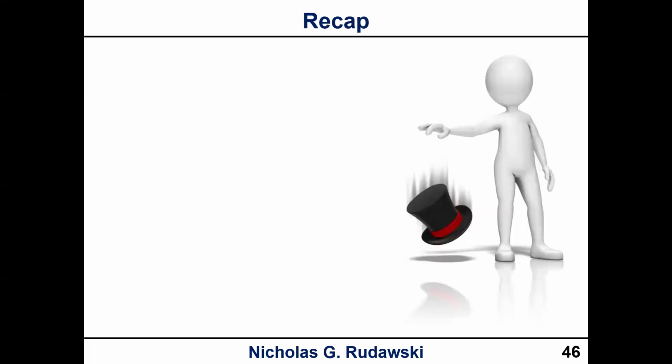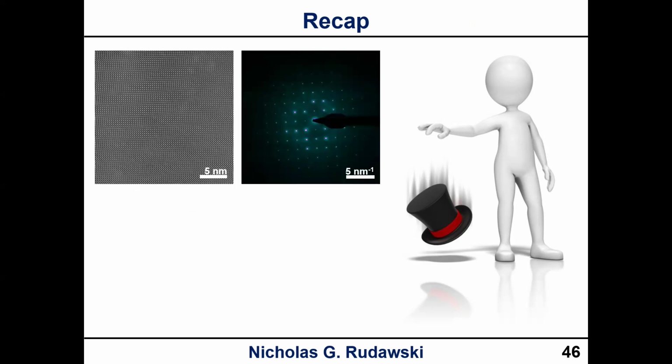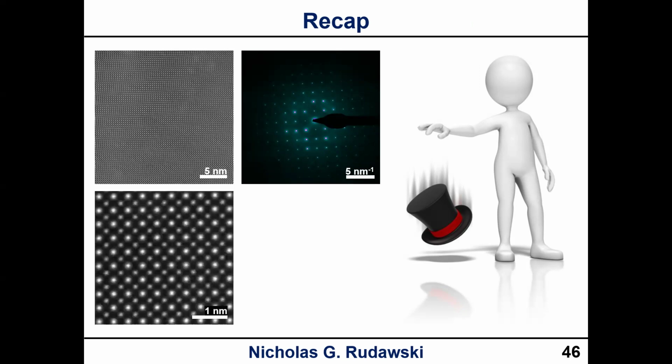All right, so just to recap, okay, we talked about high res leading off. In my opinion, that is the basis for everything else and the most important technique, okay, as an essential technique. Okay? And then we went to selected area diffraction and its importance as a structural analysis technique. Then we went to CS-corrected HAADF-STEM, which is becoming more and more ubiquitous and which has replaced high res as the preferred atomic resolution imaging technique.